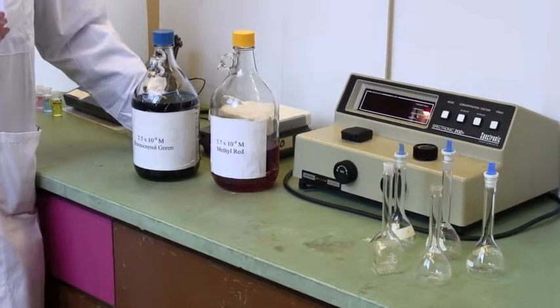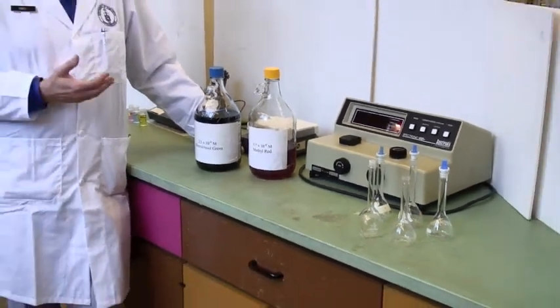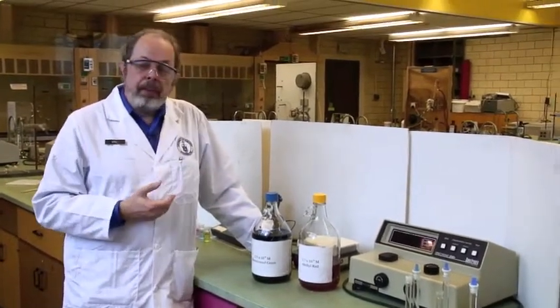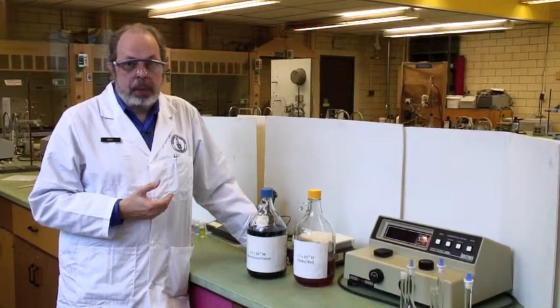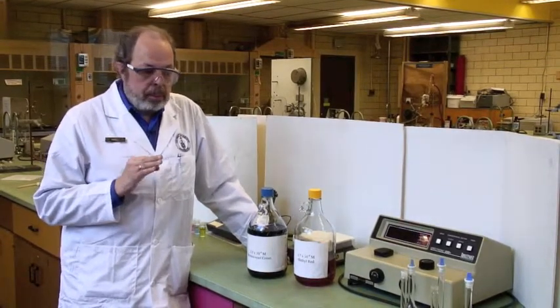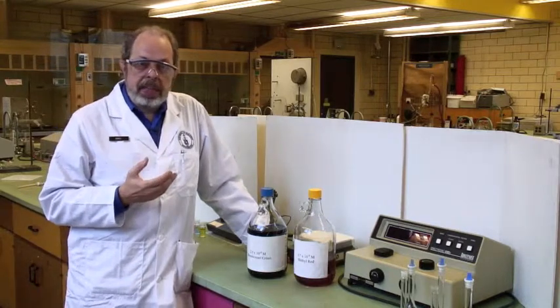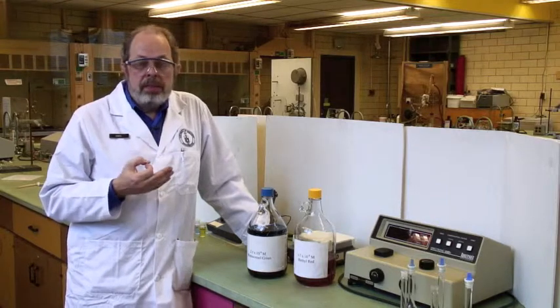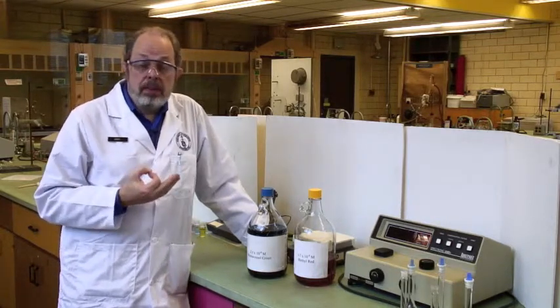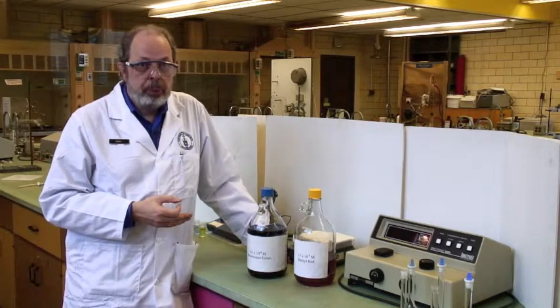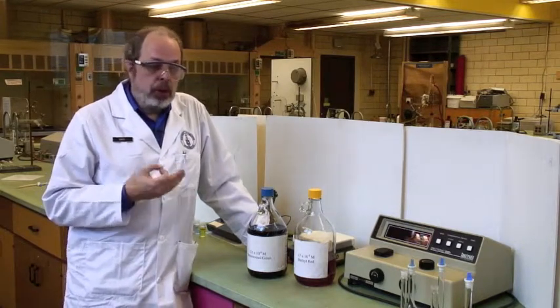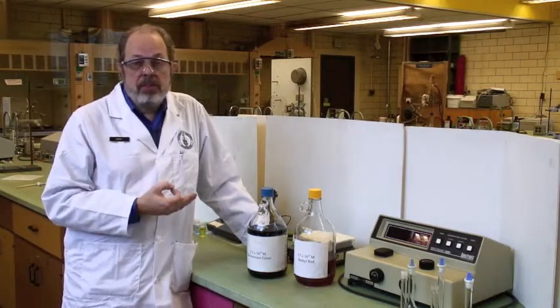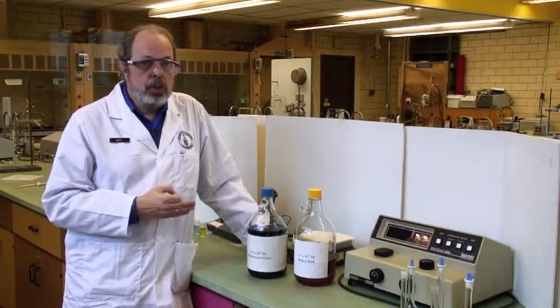You'll be making up solutions of these at different pHs, and you'll be investigating them at various wavelengths using a Spectronic 20. Previously, you have been investigating colored solutions where only one species has been present that is colored, so it's really quite easy to apply Beer's Law. In this case, you're going to have two different colored species in the same solution. Let's go to the board and talk a bit about that.